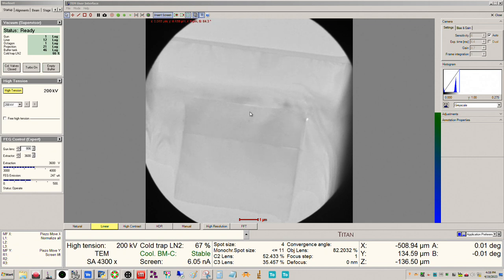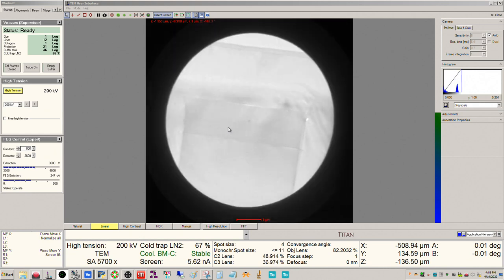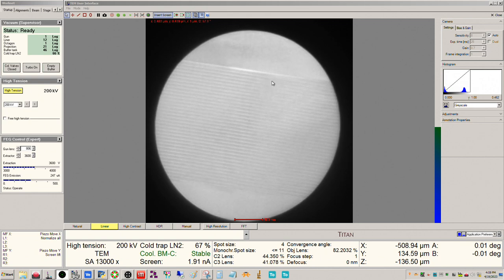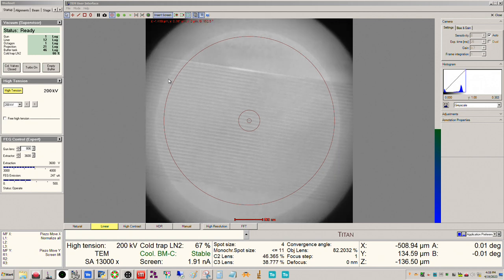So we're going to actually map the border of this so we can include both the quantum well structure as well as the matrix. So actually, if I mag in here, you can kind of see the quantum well structure, right? And this actually has some really fine divisions here that are just a few monolayers thick. So all in all, pretty neat sample to work with.